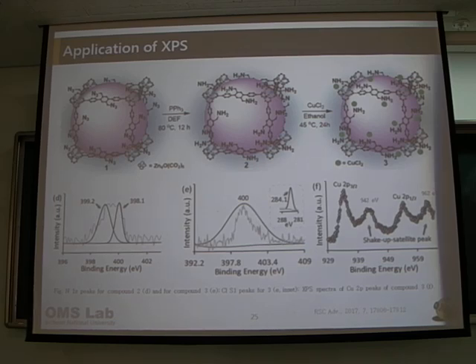It should be that the weight loss should be less if copper is incorporated. And no, I'm asking, the weight loss is due to what? Due to the amine or more? Here it should be the amine reaction, because when it will interact.